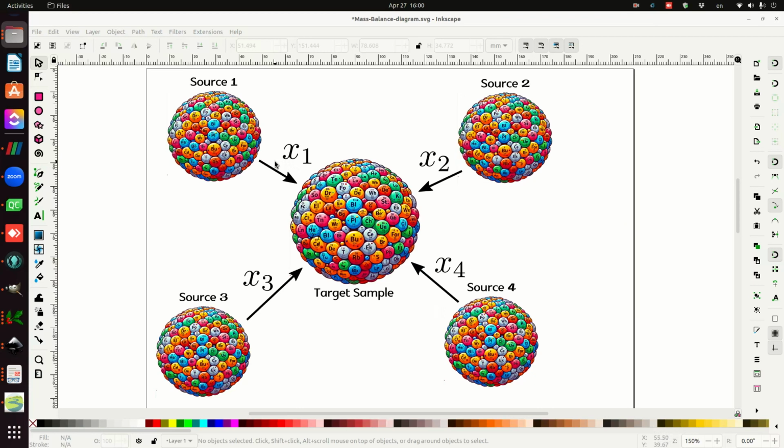One thing to point out is that I'm recording this video on a Linux machine. You will probably use SedSat on a Windows machine or on a Mac computer. Everything is going to be identical. The SedSat program is the exact same software with the same exact menu systems and so forth on any operating system. So let's get started.